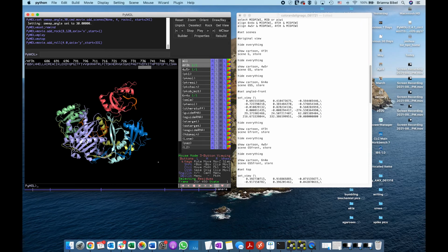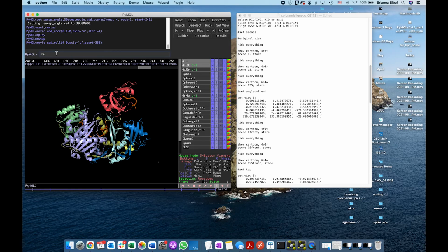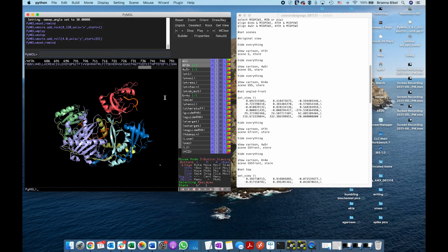And so that's going to come into play when we look at our scenes. So let's go ahead and we'll clear that. So mclear, and then I think if you do mset rewind, or if I went back to movie and reset it that way.